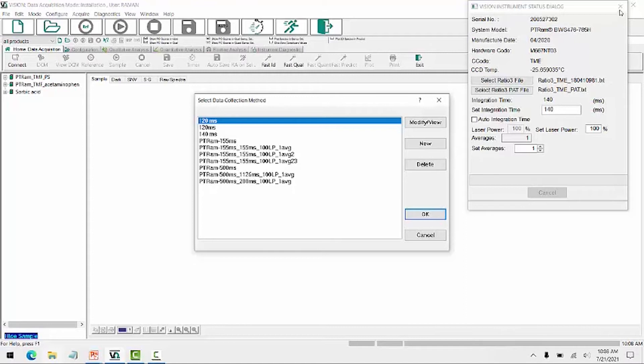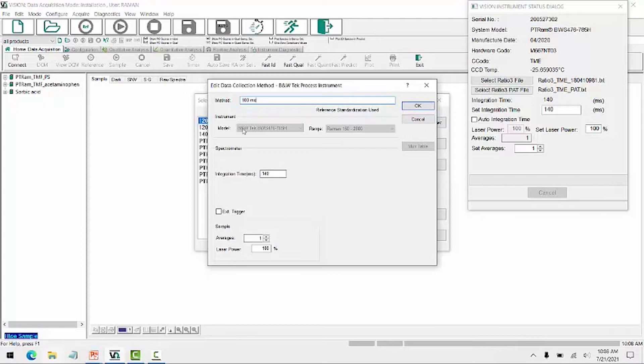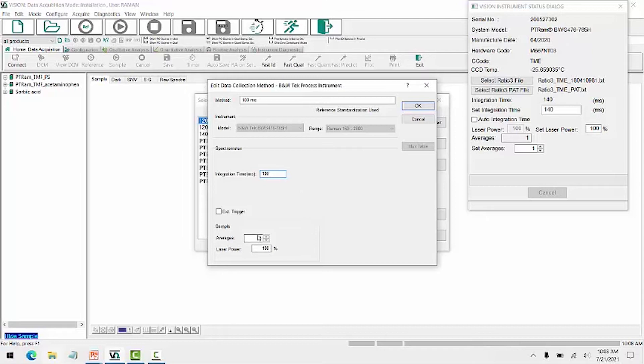So let's now go and create a new DCM. I'll create a DCM which uses 100 millisecond integration time. So here I don't have the ability to change what the instrument is. It indicates reference standardization is used, which is the language to indicate that the relative intensity correction will be applied, as should be done for all your Raman spectra. And then we set my integration time here. I will leave my average at 1 and use the full laser power.